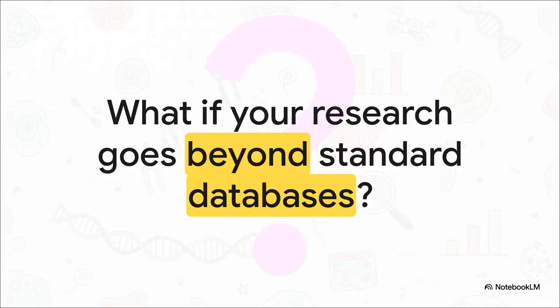Okay, let's dive right into this. We all know standard RNA-seq databases are undeniably incredible resources, right? I mean, they've mapped out adult human and mouse tissues in stunning detail. But what happens when your research goes beyond them? Seriously, what do you do when you're studying an obscure tissue, maybe a highly specific developmental stage, or an embryonic condition that simply hasn't been cataloged in those major adult databases? How do you calculate tissue-specific gene enrichment then? Well, that exact bottleneck is what we're going to solve right now.